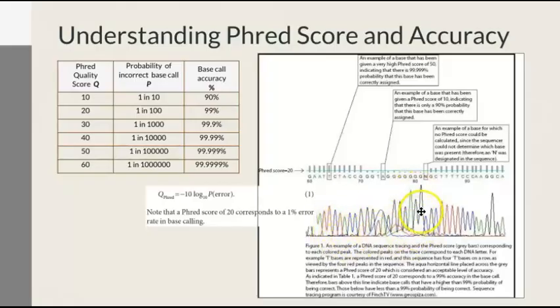As you get to here, you have more N. N typically means that it doesn't know. It can be any of the NTPs. It can be an A, T, C, or G, and it's trying to guess. Here, even though it's calling it A, you can see that in many of the reads, it calls it as an N. You also have some that will be calling G, as a red. I don't remember what the red color stands for.